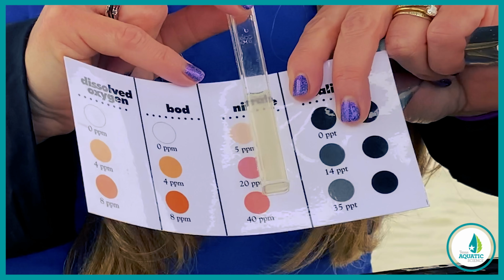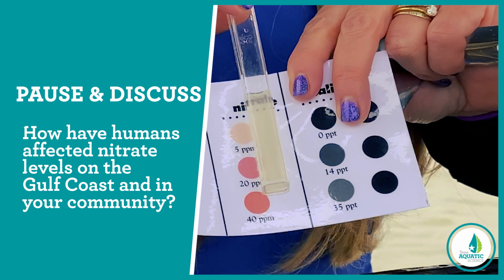Let's pause this video and take a moment to record the result as nitrate ppm and discuss how humans may have affected nitrate levels along the Gulf Coast and in your community.